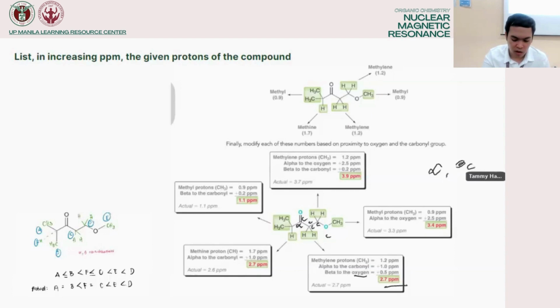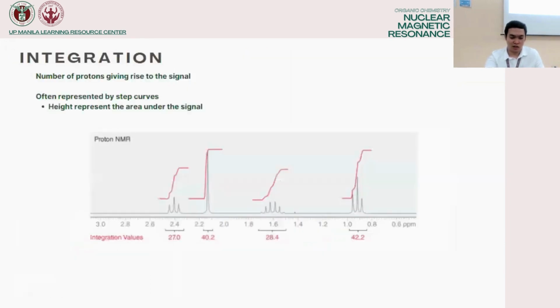Alpha, beta, carbon. So, ano lang yan, yung alpha-beta na tinatawag dyan, arrangement lang ng carbon molecules. Pag alpha, siya yung chiral center, usually. Pero in this case ba, is our molecule chiral? May chiral center bang molecule? Wala. Wala siyang chiral center.